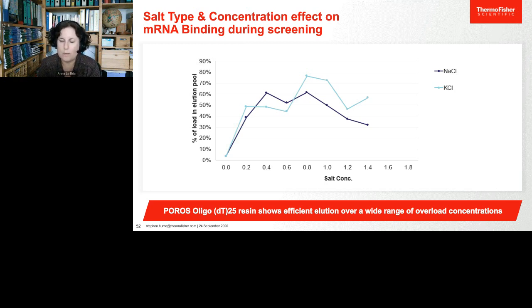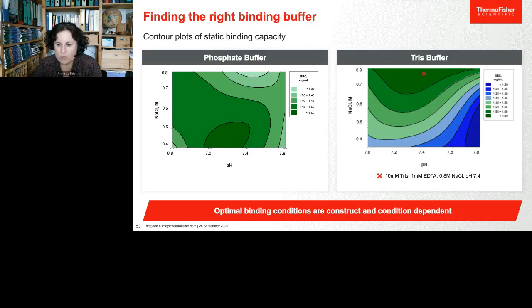It is more dependent on the structure, the sequence of the RNA. For example, a 3000 nucleotide RNA doesn't mean obviously that it will be more likely to precipitate or aggregate because of its size. It doesn't work that way. We just also wanted to check the pH and the phosphate.